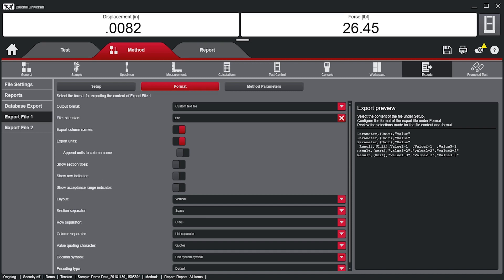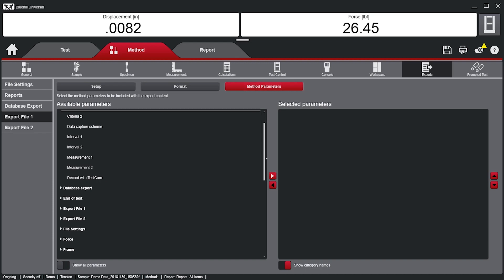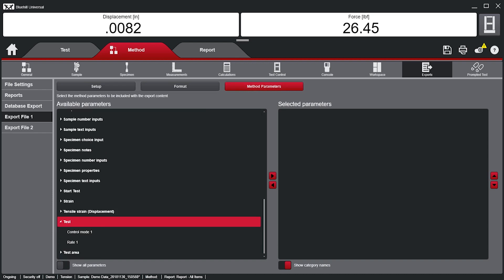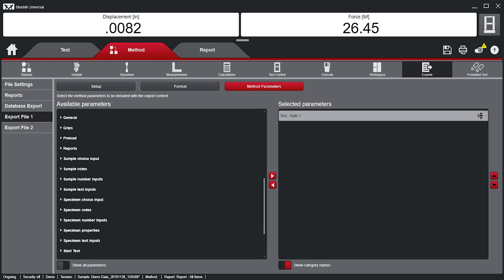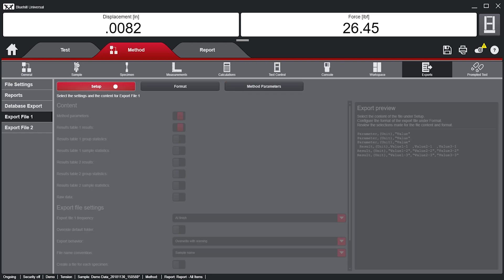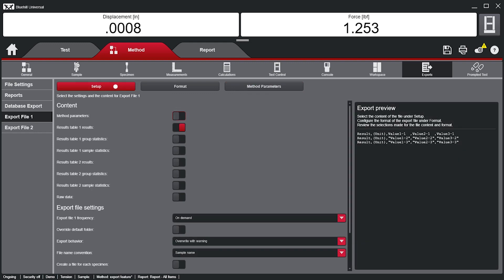If desired, under Method Parameters, users can add non-results-based information associated with the method, such as test rate and preload value. Moving back to Setup by toggling the Method Parameters option, users will add their selections to the export for each specimen.